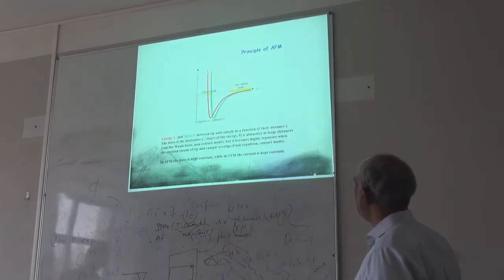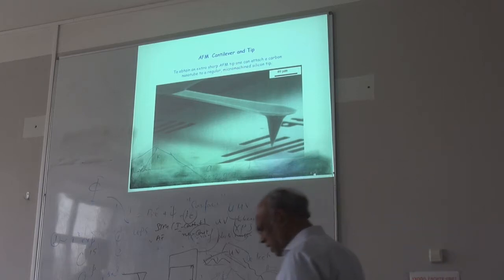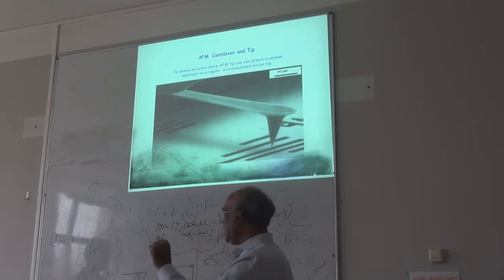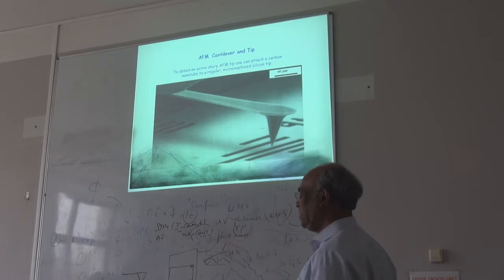Usually when you buy a cantilever, that's how they look. What's the price? This we recently bought. You can get about 10 of these tips for less than $100. They are only tips, really small, in a small box.